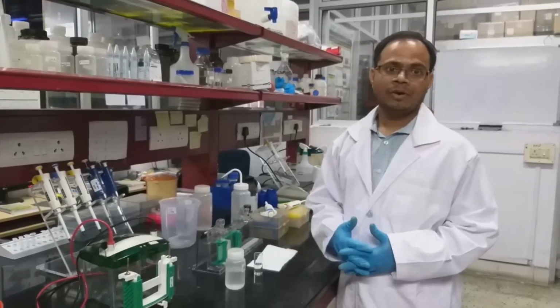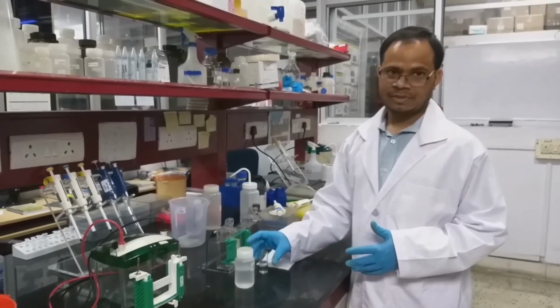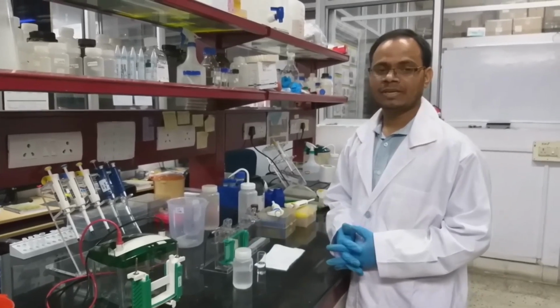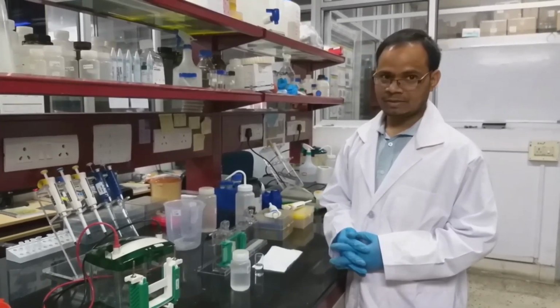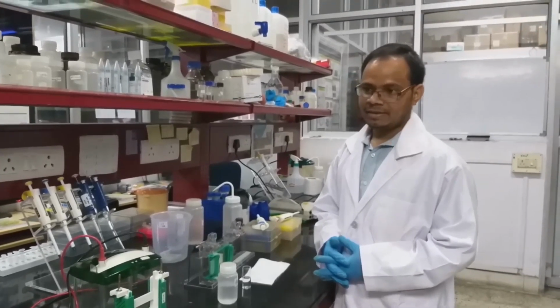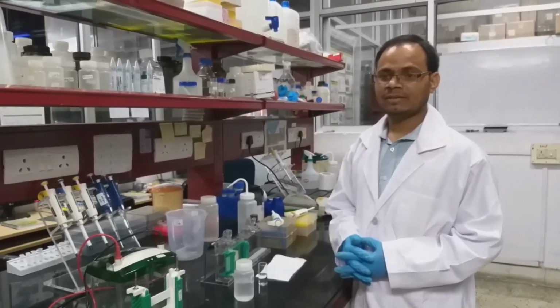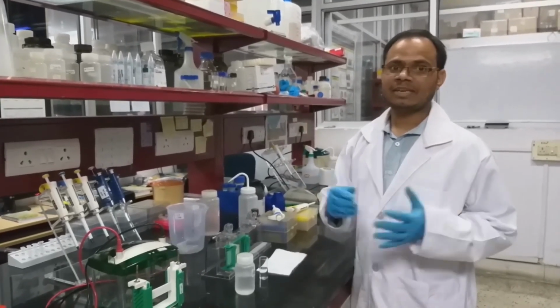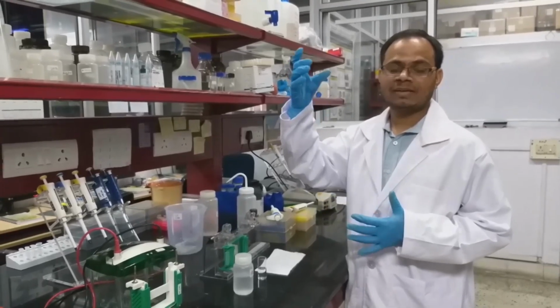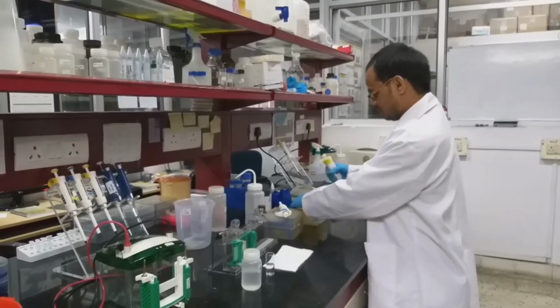We have to add 100 microliter of SDS to resolving gel. It plays a very crucial role in polyacrylamide gel electrophoresis. It imparts negative charge on the polypeptide chain, so that despite their charge, they will move based on the molecular weight. So I am going to add SDS.